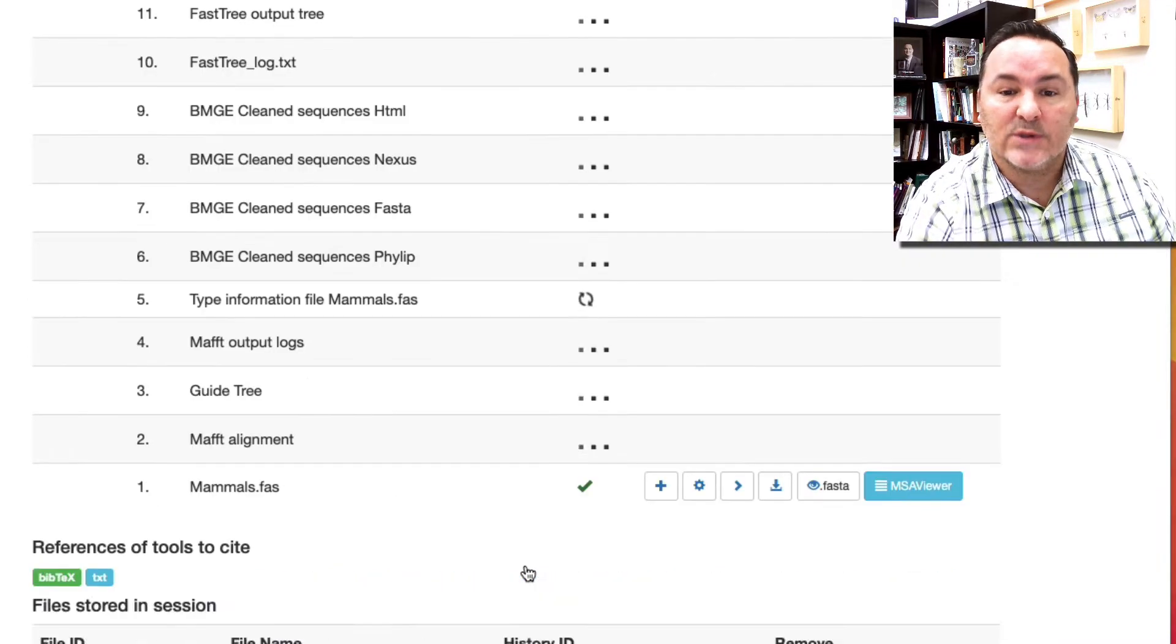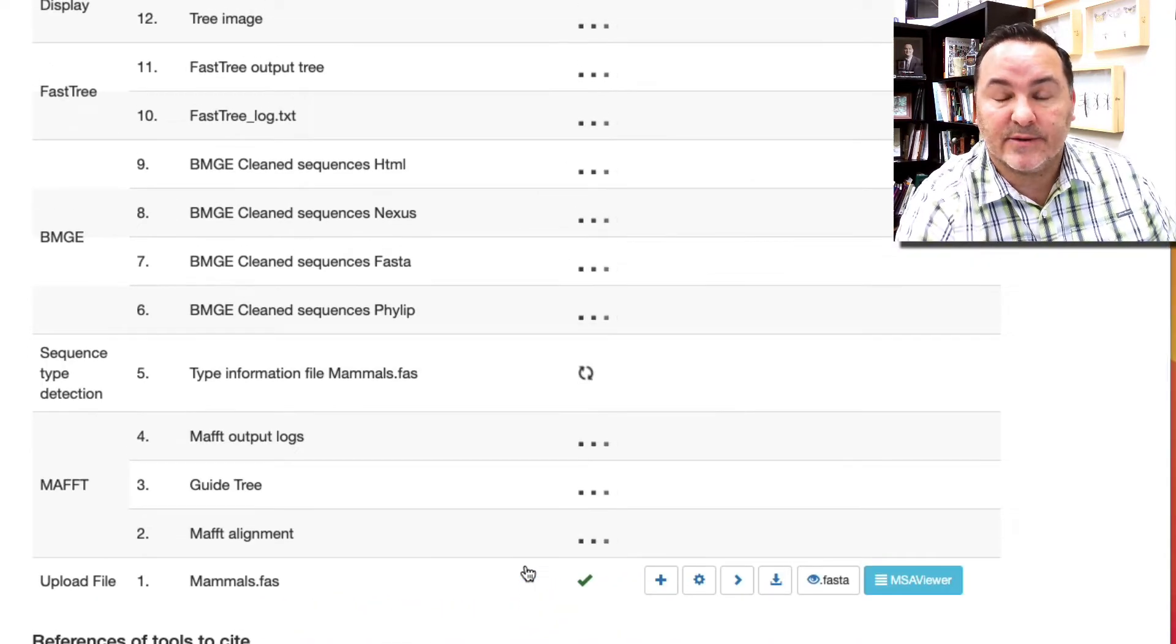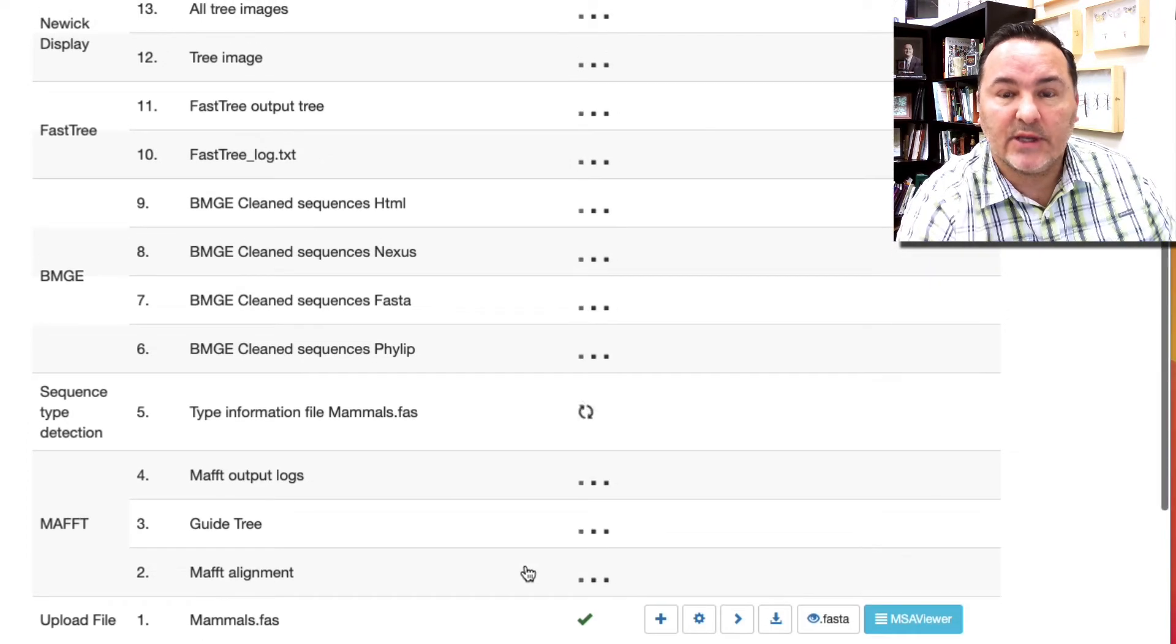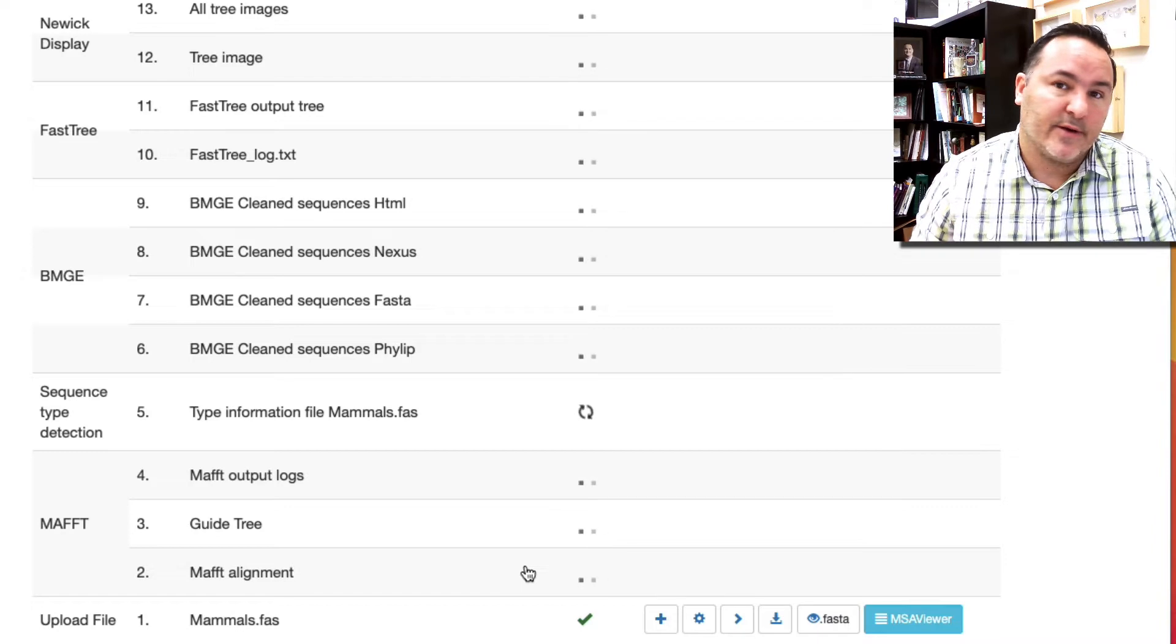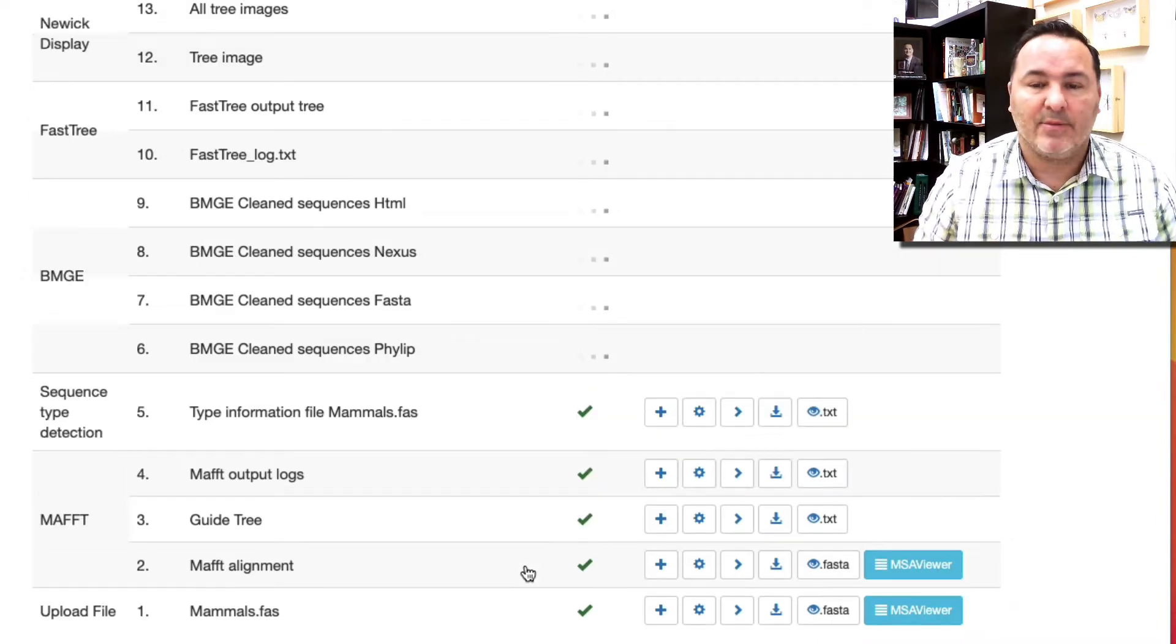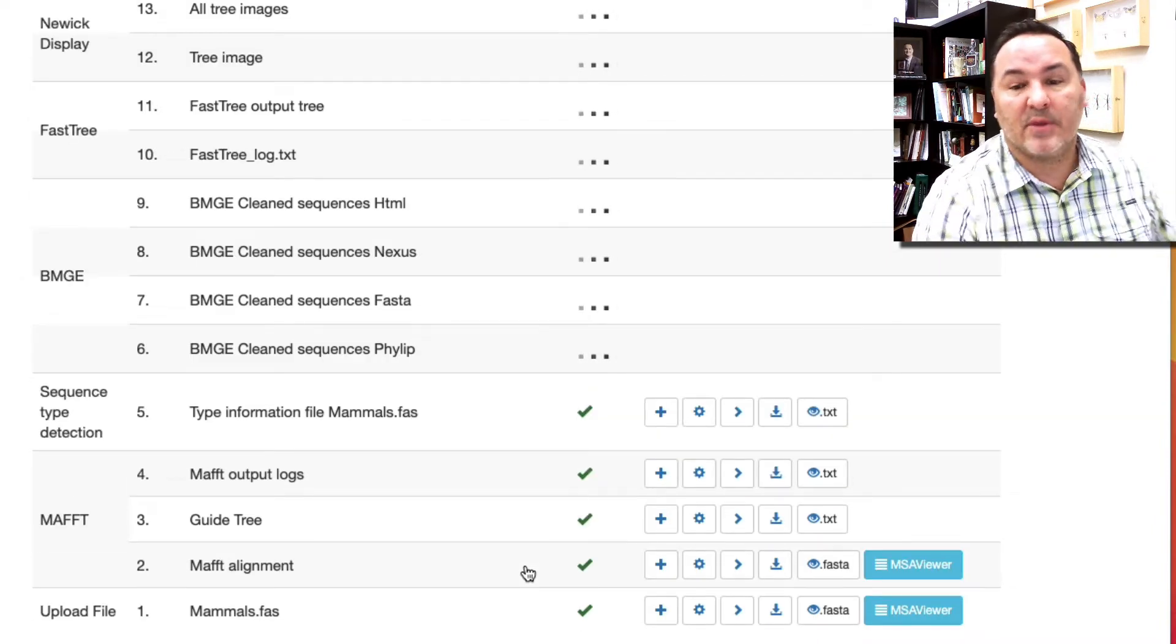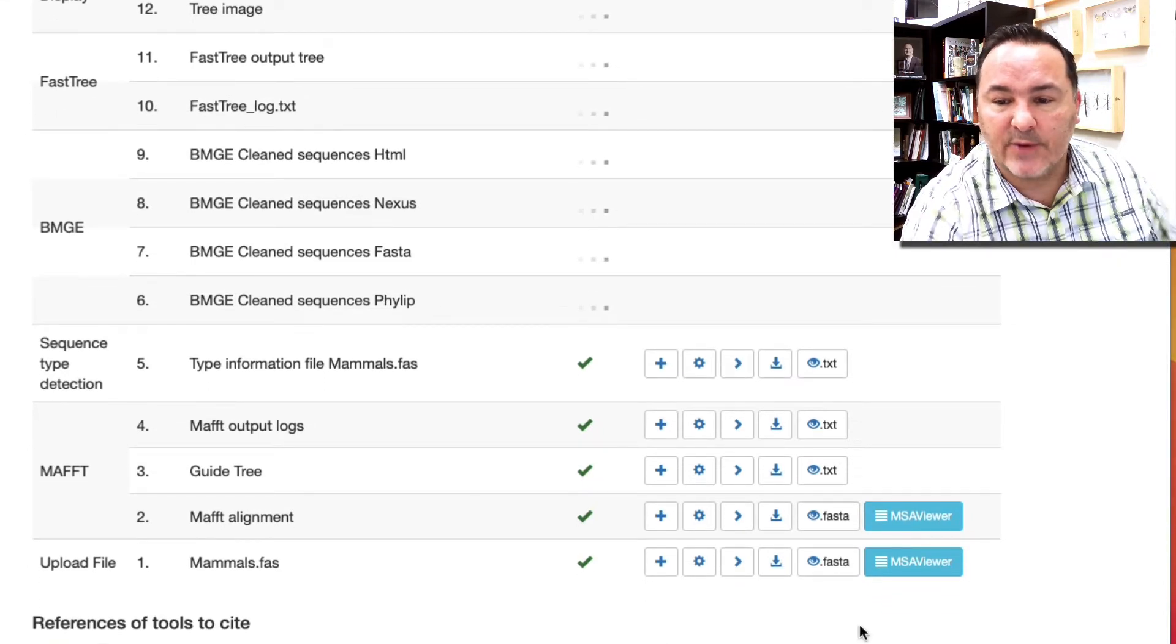A lot of this is dependent on how busy their server is. If their server is really busy, you get put in their queue and it may be a while until their server gets the chance to grab your data set and start doing something. But you can see, for the most part, it's pretty quick.